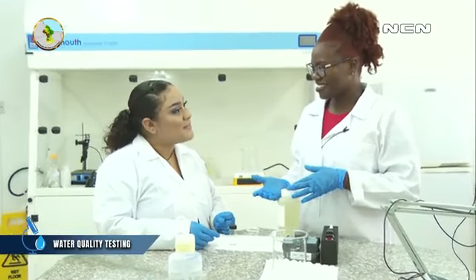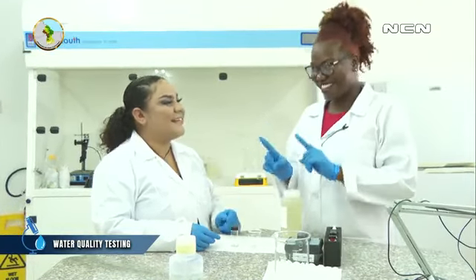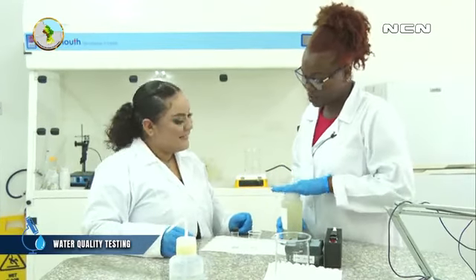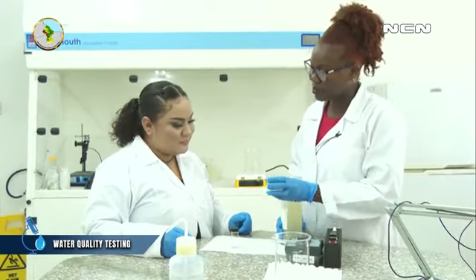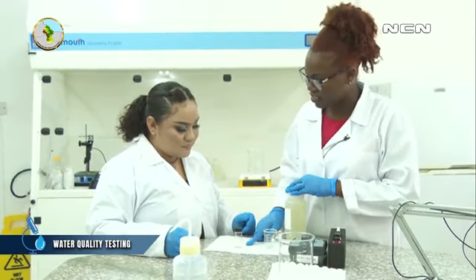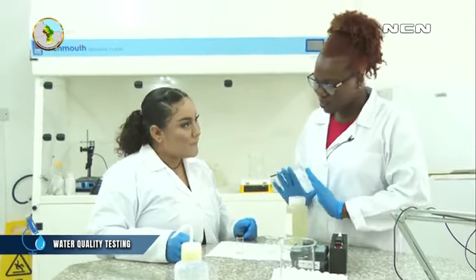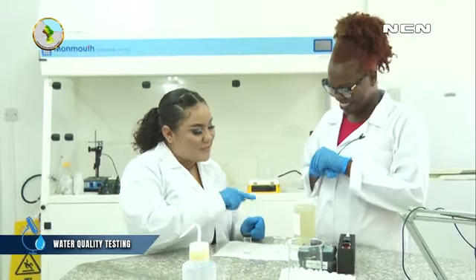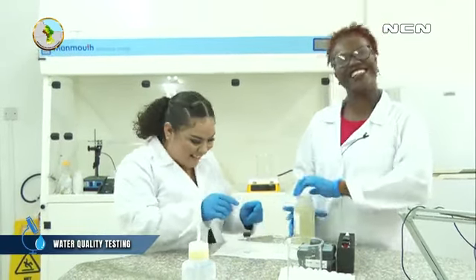So cloudy water is okay to drink? Depending on the value that you're getting, right? Okay. So we're going to transfer some of our water sample into this beaker, and that is going to make it easier for us to transfer it to the sample cell. So which part would you prefer doing? Transferring it into the beaker or into the sample cell? I'm going to hold the beaker. You want to? Okay, so I am.